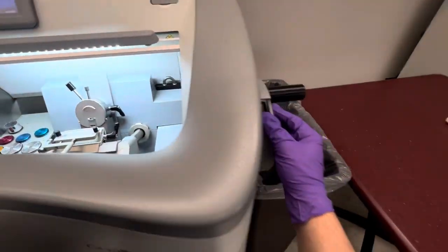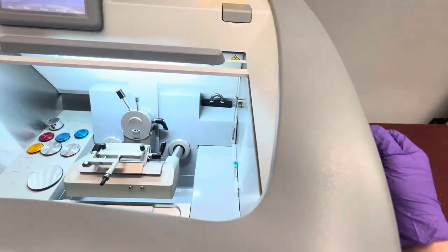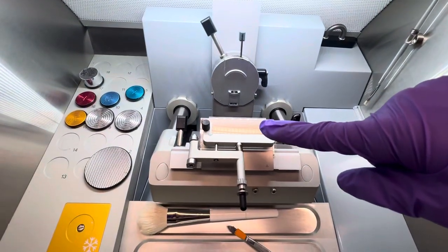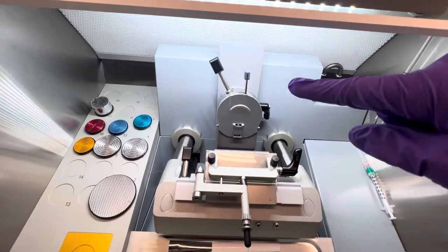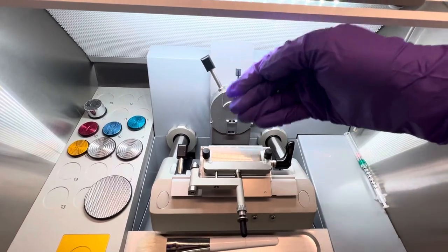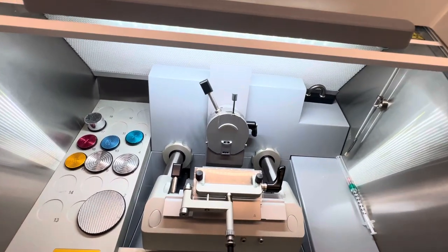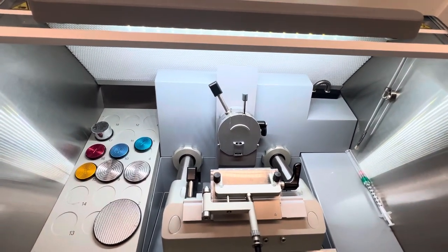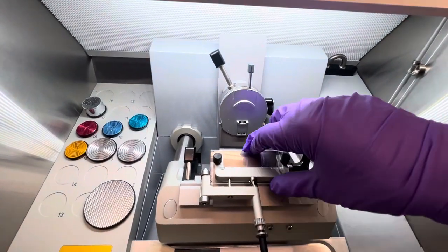Okay, getting to the point, this is your hand wheel. The hand wheel, in this case, sometimes it'll actually move the blade, but in this case, it moves the specimen head. Same effect, because it's going down and it moves it slightly forward each time. That's the actual stage going forward.